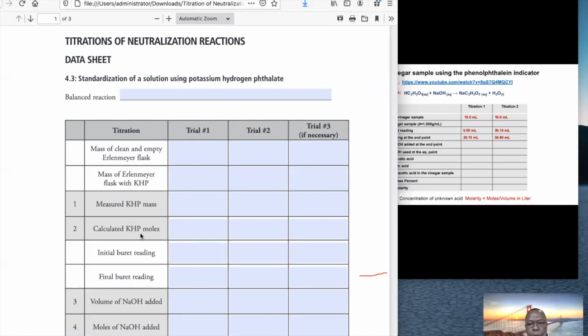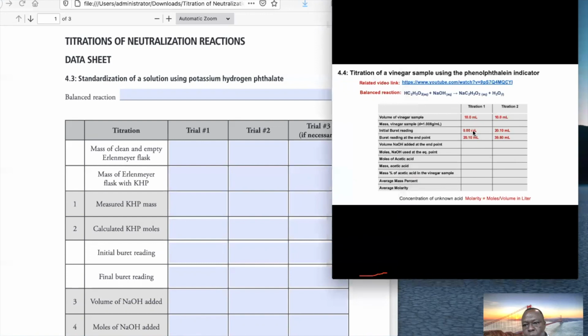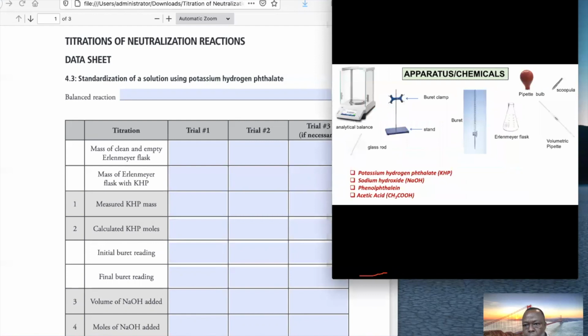You read the initial volume. So it was at 0, 0. All right. It was T0, 0. You know how this works? I see students making mistakes.